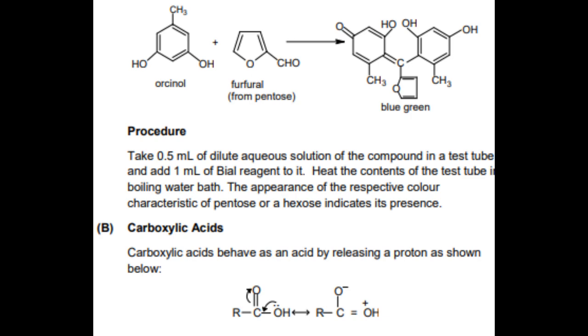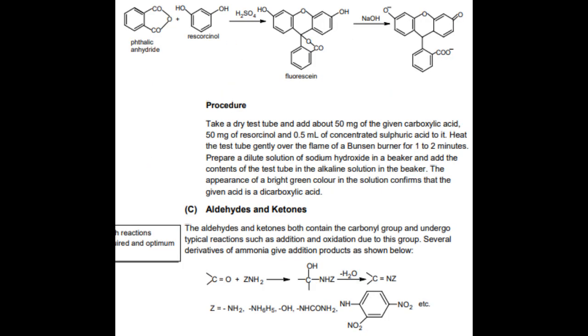Look at the screen. Aldehydes and ketones can be distinguished by using some tests in which the aldehydes can be oxidized to carboxylic acids while ketones are not oxidized. These tests are Tollens' test, Schiff's test, chromic acid test and Fehling test.